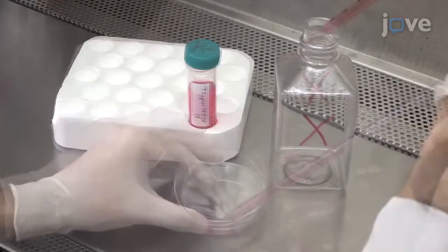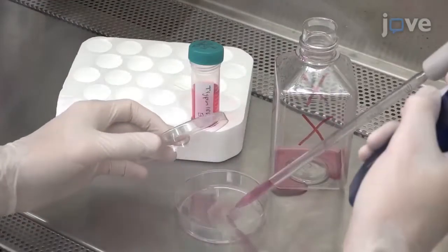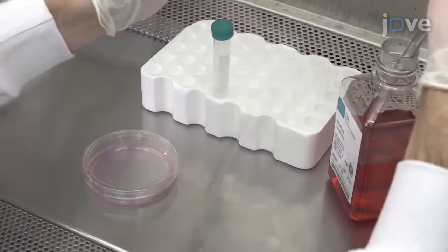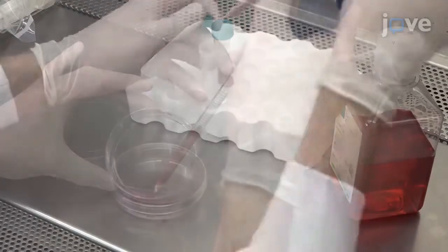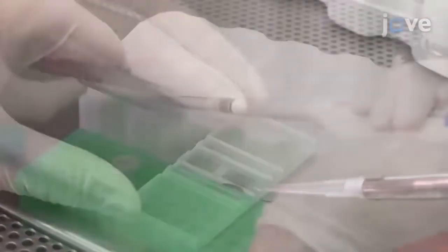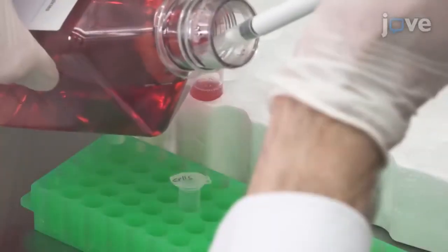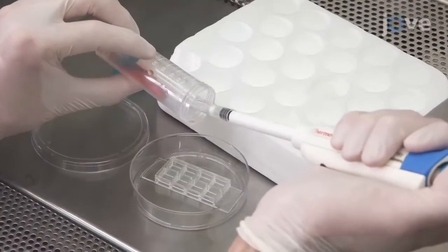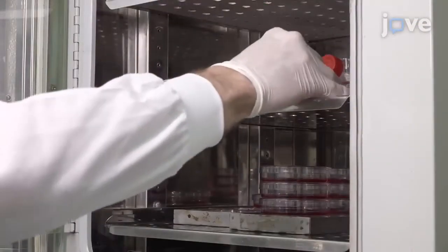One day prior to imaging, aspirate media from a culture dish and replace it with 2mL of Trypsin EDTA Solution B. Then incubate the dish for 5 to 10 minutes. Once the cells have detached, add 2mL of culture media to the dish to neutralize the trypsin. Then use a hemocytometer to count the RBL cells. Adjust the volume of the suspension with culture media to achieve a concentration of 750,000 cells per milliliter. Next, add 10µL of the cell suspension to a chambered cover glass with fresh FITC-dextran supplemented culture media.